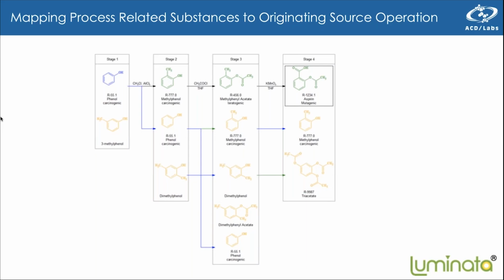And then as you go through your unit operations, you can see potentially, in this slide, for example, at stage 2, the dimethylphenol being transformed as a function of the transformative unit operation to another synthetic component. So what you have here is the ability to map out the entire process composite composition, okay? And what that ultimately gives you is identities for each of the potential substances you might observe in the final material.